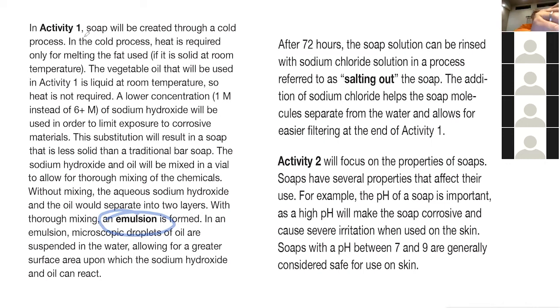So what you're going to do next is a process called salting out. That means you're going to be adding really concentrated sodium chloride, because you want all of those head groups, the polar groups, the carboxylic acid part, to be bound to sodium.